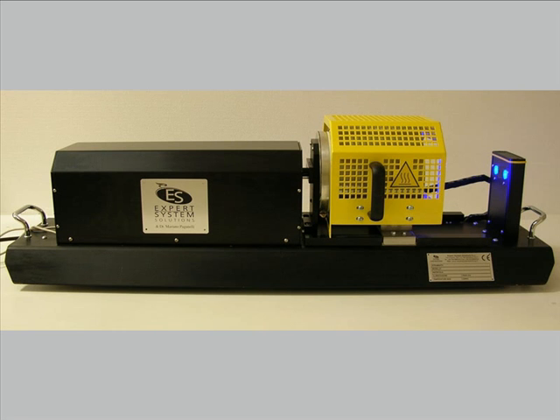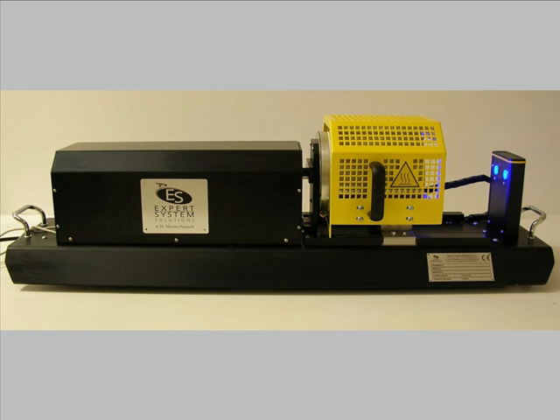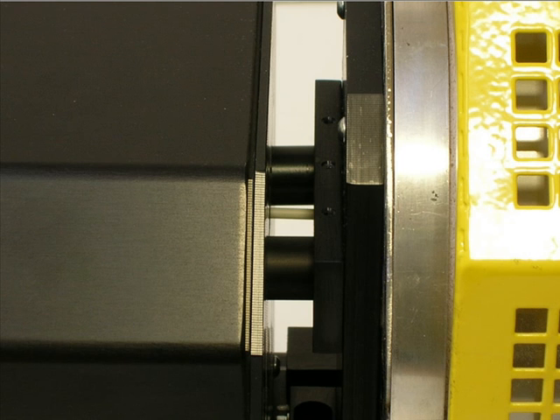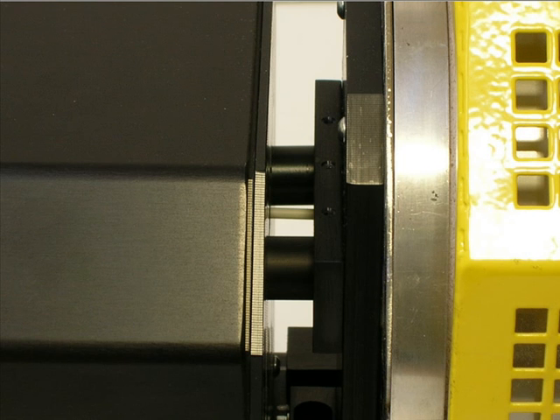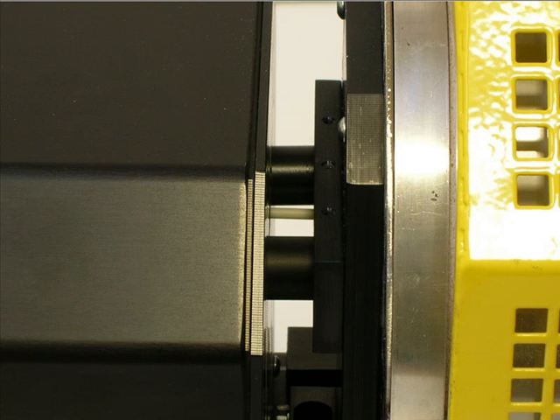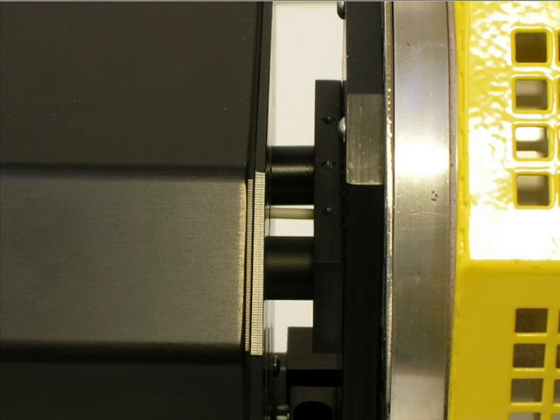MISURA LT is the only dilatometer which can easily and hassle free carry out high resolution measurements on very thin materials or on incoherent materials or on plastic materials which cannot be touched during the test. The two optical paths are completely protected and all the optical setup is enclosed inside of a body which is moved by a micrometric control to enable a very precise focusing.